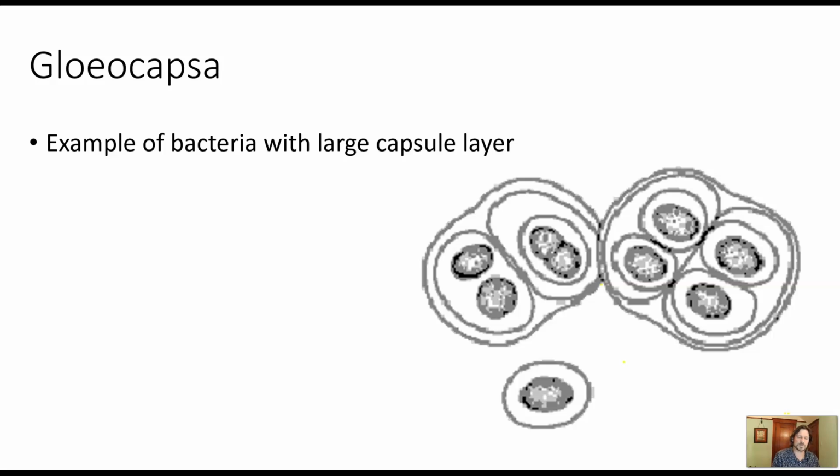Okay, the next one I took up is Gleocapsa. And the reason I took up Gleocapsa, when you see it, it looks like a green dot, just a little green dot. But what it has is a feature that we've talked about for bacteria, and that is a capsule. And that's that gelatinous, proteinaceous covering to the outside that they can use for protection and to adhere onto substrates. And here it actually gives them a little protection, and they kind of stick together.